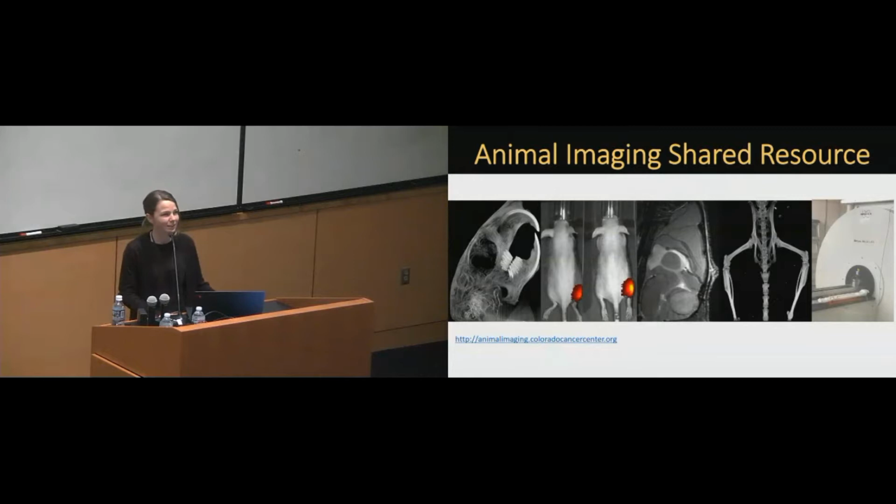I'm going to take the first 5 minutes to talk to you about our animal imaging core here on campus. Some of you have maybe worked with us already, or some of you may in the future, so I'll go over what we do.